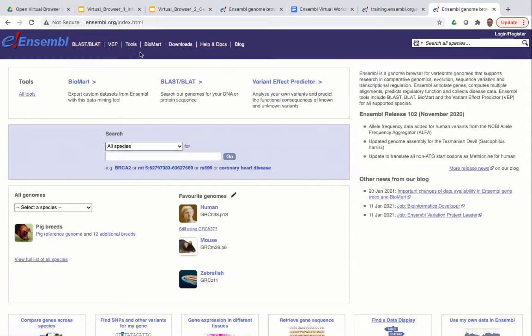We'll explore these links in more detail through the course, but the blue bar always appears at the top of every page. There's also a quick search option where you can type a gene of interest and quickly navigate there without coming back to the homepage. On the main part of the page you can see the main search box — we'll use this a lot throughout the course as your main portal into the Ensembl data. Here you can search for gene names, gene IDs, genomic coordinates, variant IDs, phenotypes, and many other search terms.